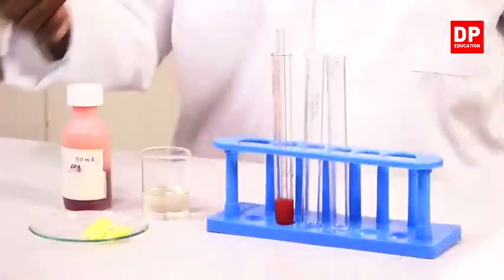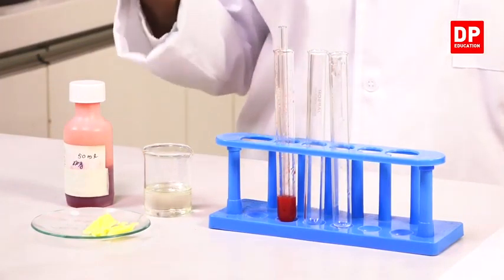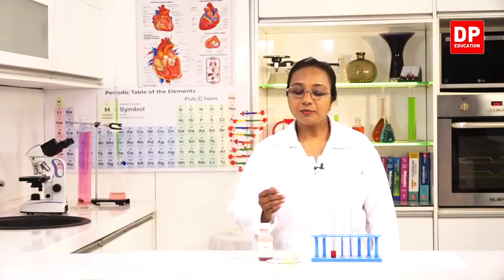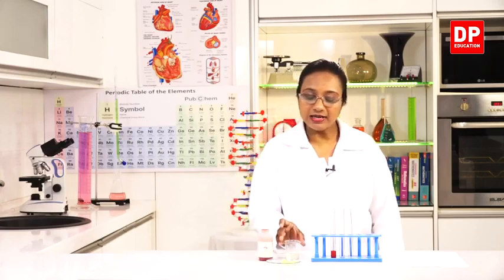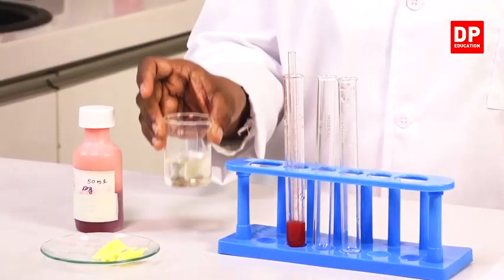Okay, students, now we are going to test for the presence of lipid in biomolecules. As constituents of biomolecules, we take food samples for our test. And as you know, lipids have two forms, the fats and oils. So I am going to use two samples here. One is butter, an example of fat, and coconut oil, which is an example of oils.